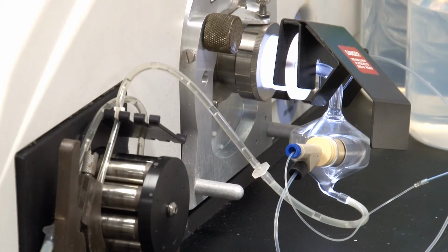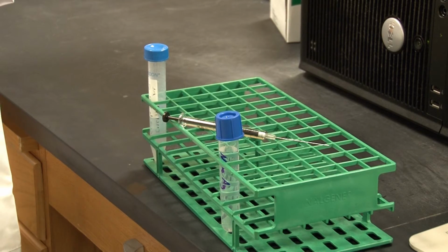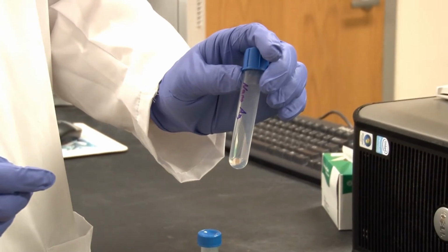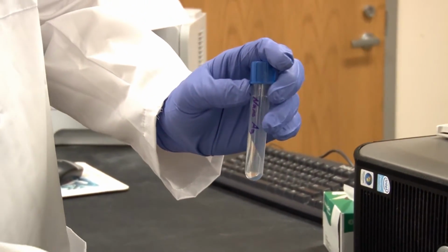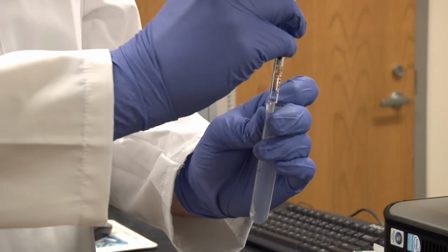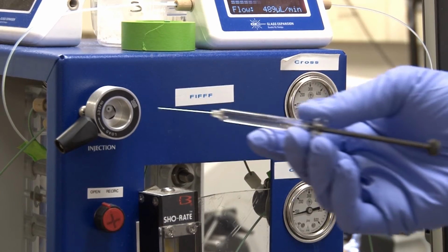For example, the test analysis we'll do today is silver nanoparticles, where we are going to look at 2 isotopes of silver as well as 1 isotope of gold, which is the seed used to create the particles during the synthesis procedure. Today we're going to use FFF ICP-MS to look for gold seeds inside nanosilver particles. We have here a mixture of nanosilver that contains gold seeds. I'm going to take a sample and inject it into the FFF.